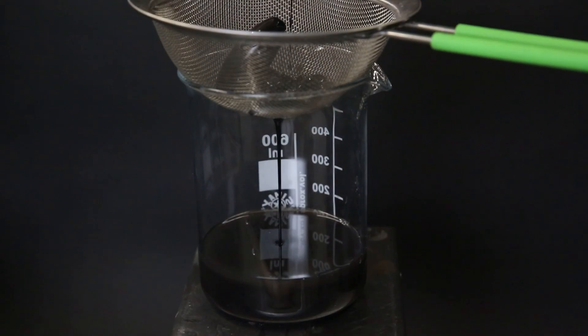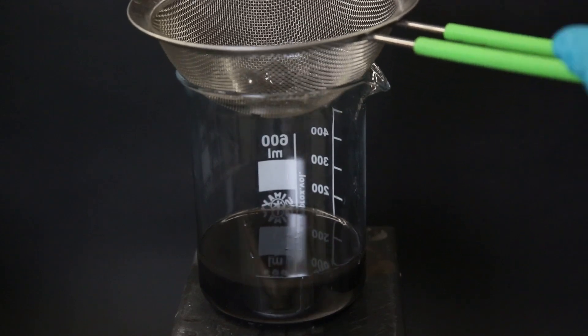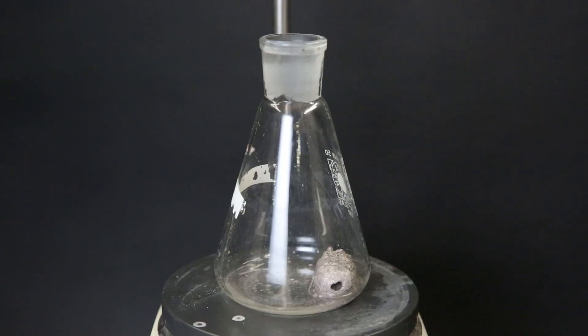I then pour all the contents together through a kitchen sieve to catch the majority of the sodium. Afterward I just mushed all the pieces together because all the beads are annoying to deal with and I put it into a new Erlenmeyer flask.